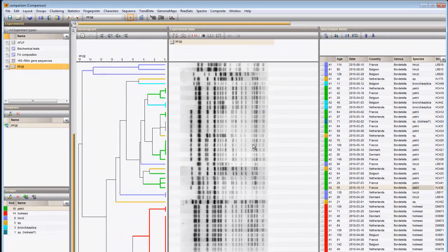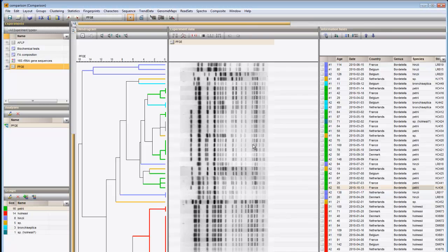If you want to learn more about the added features in the comparison window that are specific for fingerprint or for sequences, we invite you to view our other movies.